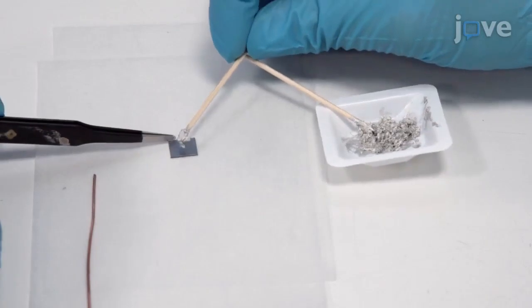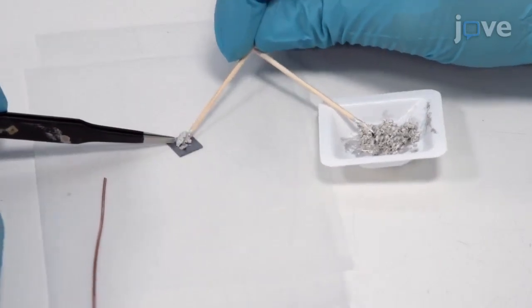To begin, apply silver paste to attach the ohmic contact to a thin-plated copper wire.